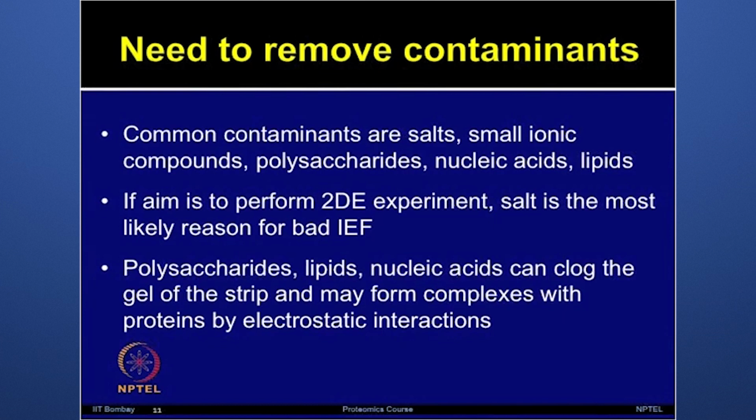There are also other contaminants which may affect the quality of your proteomic experiment, such as polysaccharides, lipids, nucleic acids.